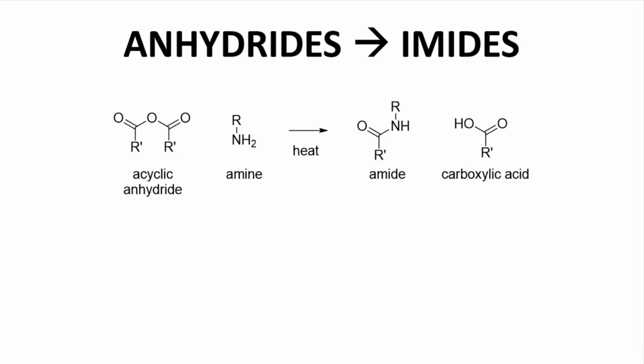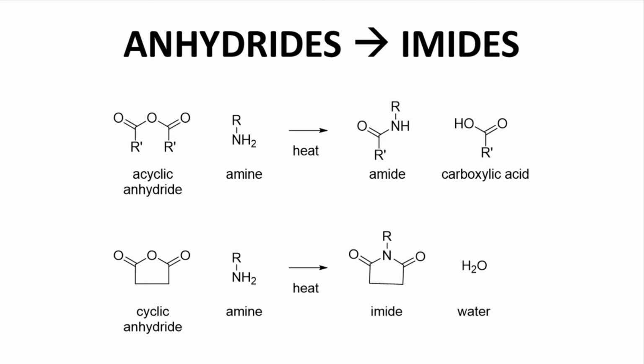This lab experiment involves an acid derivative interconversion and reacts an NH2 group with an anhydride. Typically, anhydrides react with NH2 groups to form an amide. The second carbonyl of the anhydride is lost as a carboxylic acid. If the anhydride is a cyclic anhydride, then it is possible to have the NH2 react not just on one, but both carbonyl groups in multiple steps to form a new acid derivative called an imide.